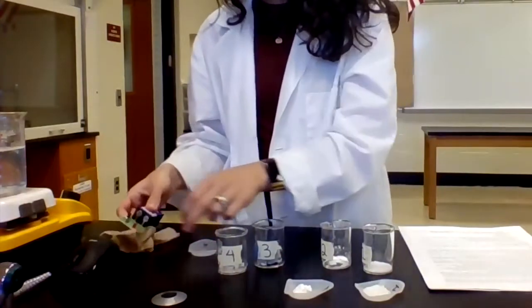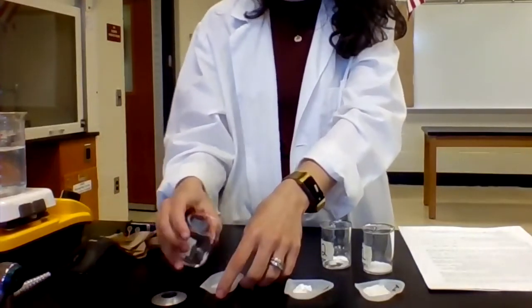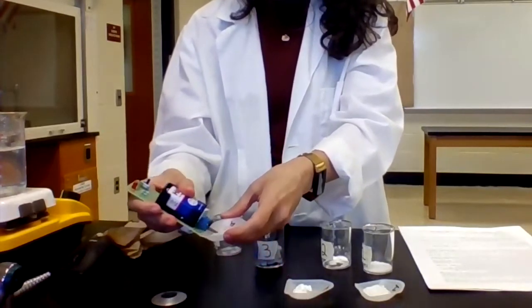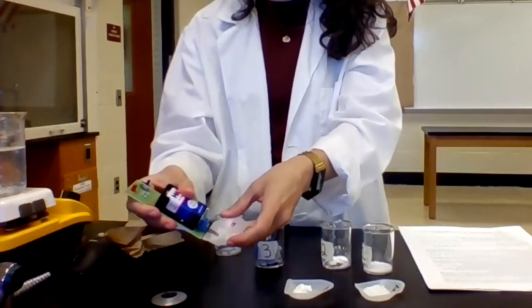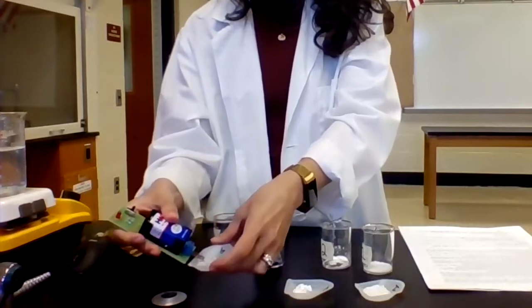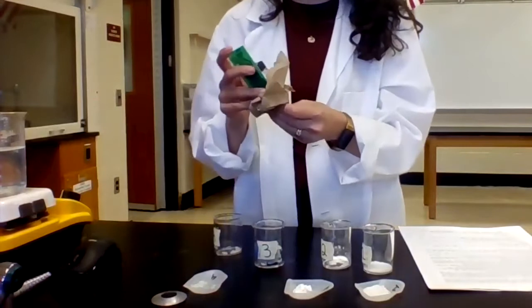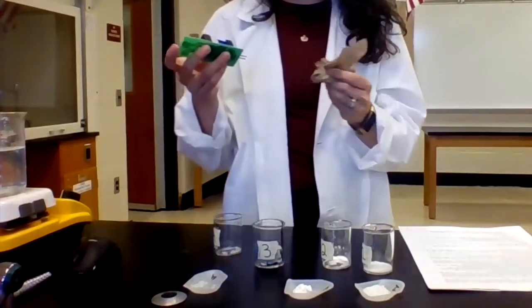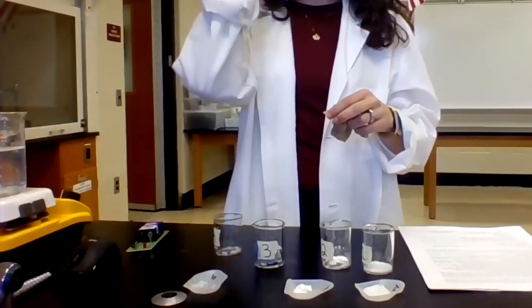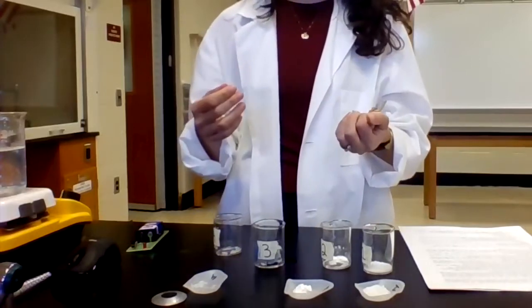Okay, and then lastly, we're going to test solid 4. Same thing, try to get good contact. And we can see it is not lighting up. So at this point, I at least know of my 4 solids that number 3 is metallic. Now what I'm going to do is figure out their melting points to try to determine if it is nonpolar covalent as opposed to polar covalent or ionic.